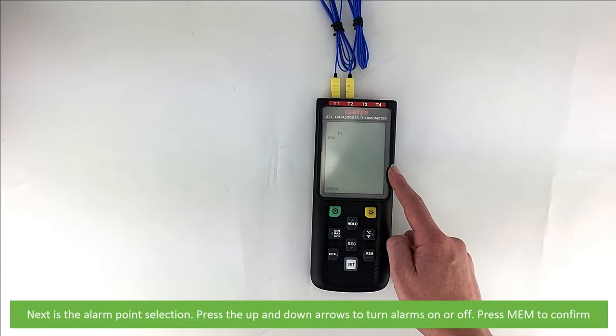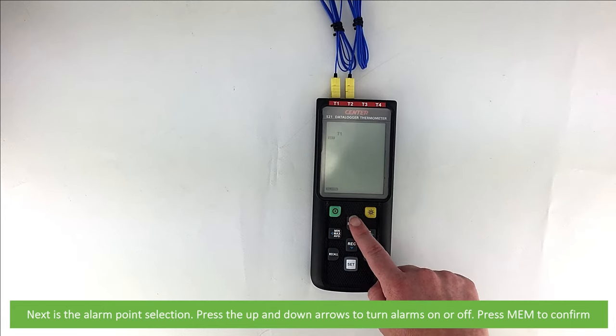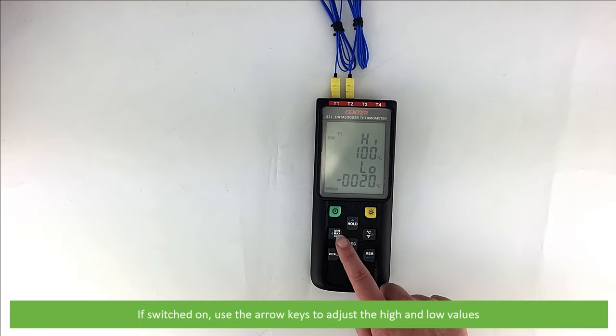Next is the alarm point selection. Press the up and down arrows to turn alarms on or off, then press memory to confirm. If switched on, use the arrow keys to adjust the high and low values.